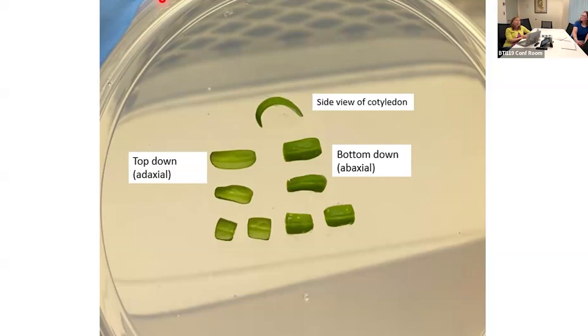Oh, I see. So, right, at one point we and others were using protoplasts to determine the efficiency, but then that didn't always translate to when we did stables. So what we do now for the guide RNAs is that we use the online tools, we pick those that are at the top, and then we'll use 2 guide RNAs per gene.